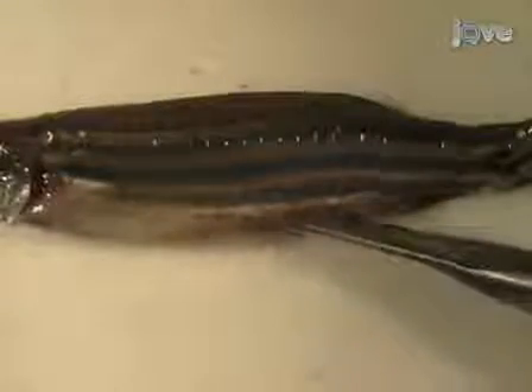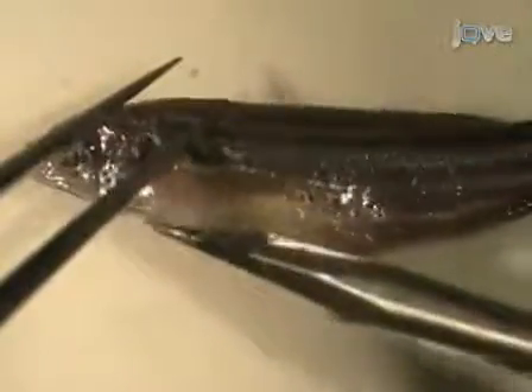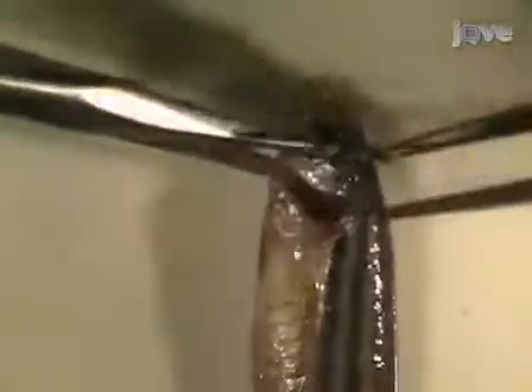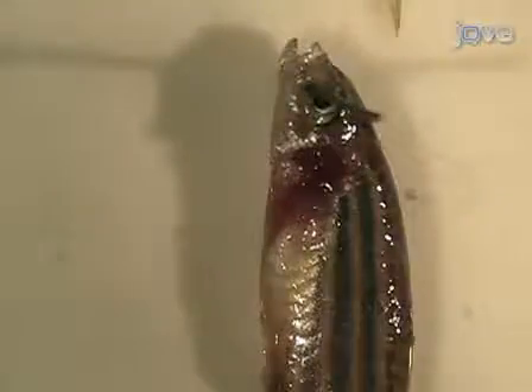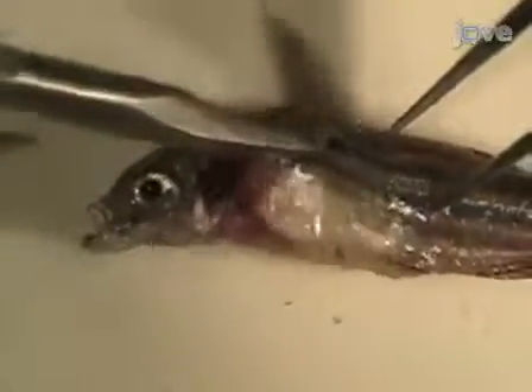Using the spring scissors, snip the skin on the belly of the fish just anterior to the anal fin. Cut the skin and underlying muscle along the belly from the anal fin to the hard covering over the gill, called the operculum. Use the scissors and tweezers to cut out the operculum and the pectoral fin, including the thick bony region at the base of the fin called the pectoral girdle. Remove them to expose the gills.